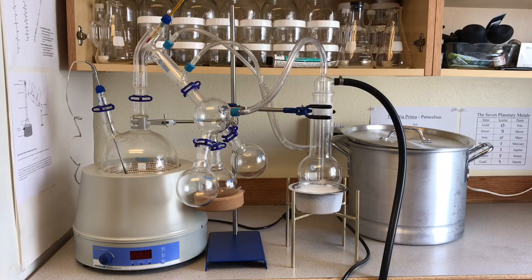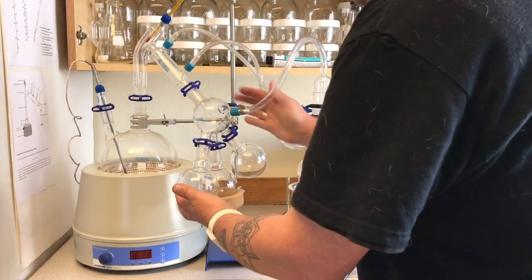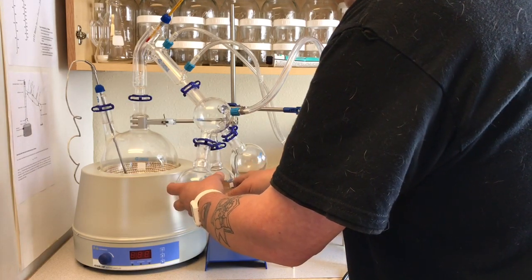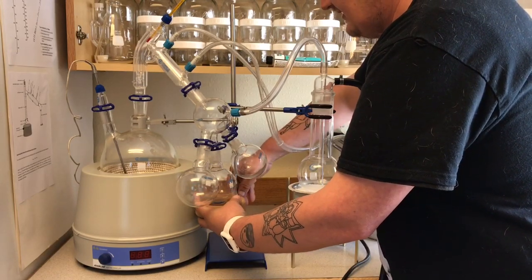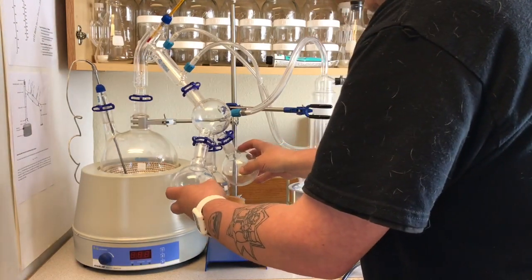So before we actually run our material, there's one more thing that we need to check, and then I wanted to go over with you just some of the concepts and ideas. I wanted to read from a couple of chemistry books that I have, an explanation of the different types of distillation. So before we can begin our distillation, we need to make sure that our cow here, this is called our cow, and these are our receiving flasks. We want to make sure that this apparatus is able to turn freely, that it's not going to get caught up on anything. That's something that we need to establish now instead of later when it's all under vacuum pressure.